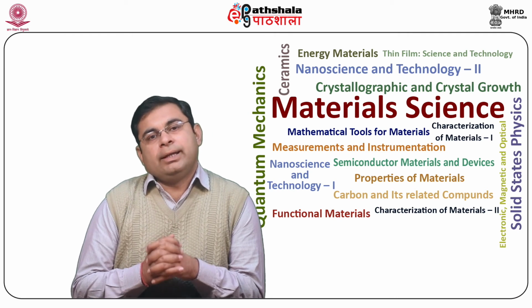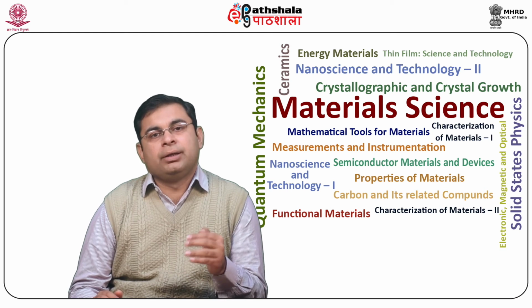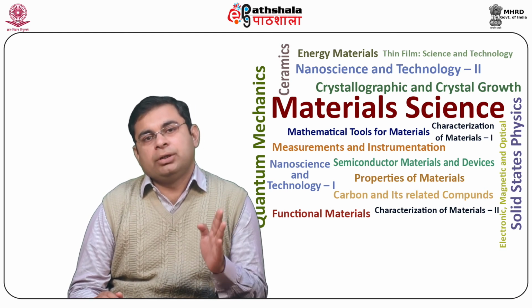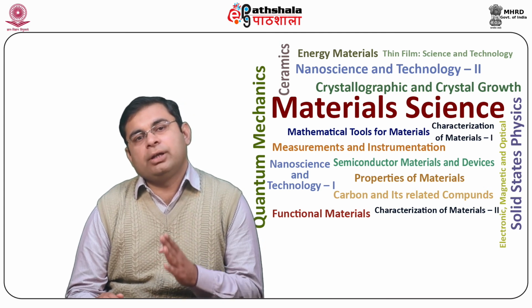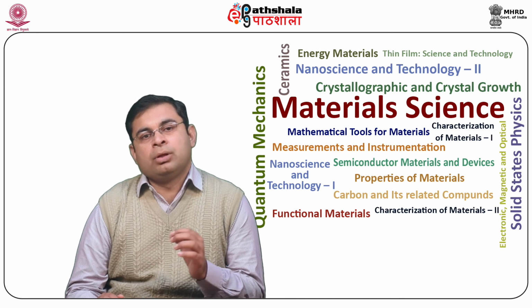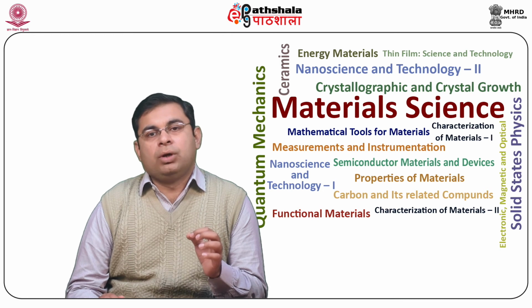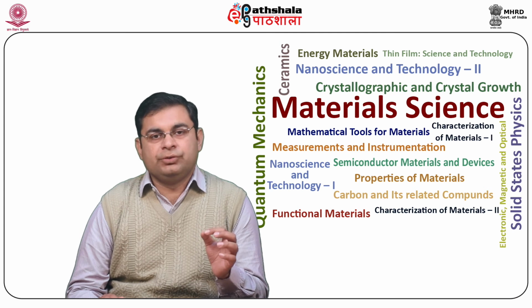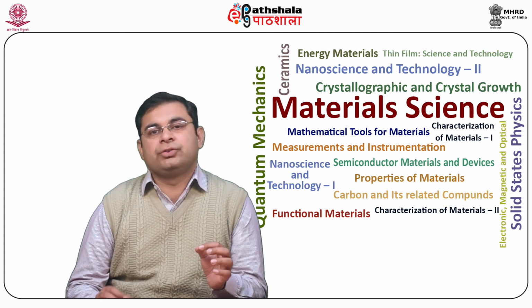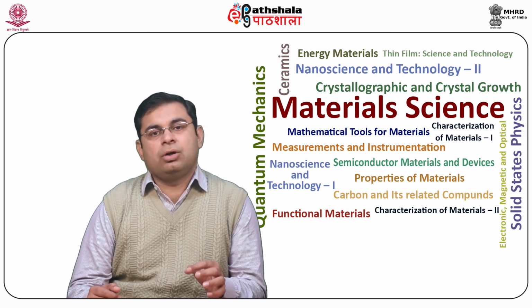C. Electron energy analyzers. The number of electrons emitted, N, is measured as a function of their energy E by using electron energy analyzers. The most widely employed analyzers are: 1. RFA or retarding field analyzer, second, CMA or cylindrical mirror analyzer, third, CHA or concentric hemispherical analyzer.